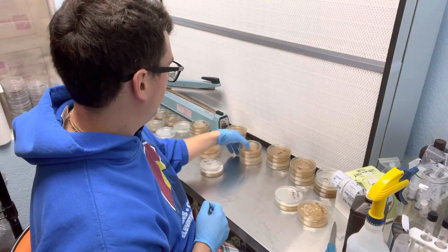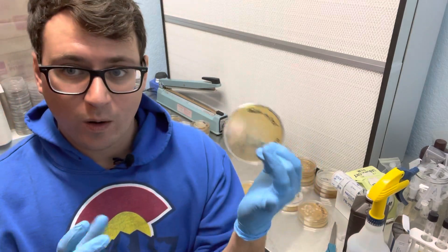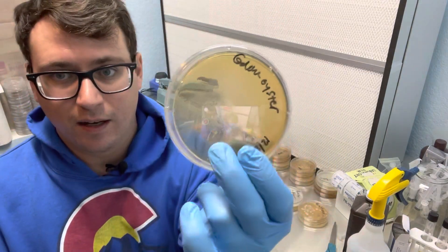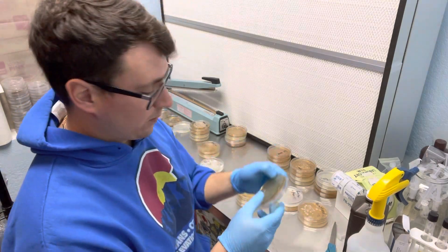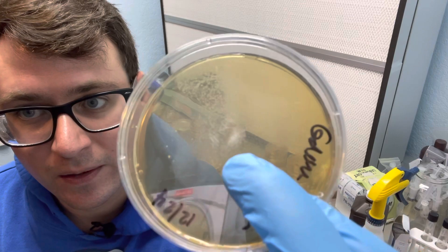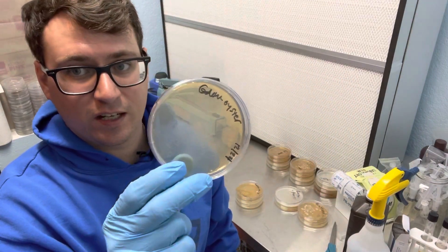But if we go to the golden oyster, this one is really taking off. You can see all those different colonies of mycelium starting. This was a 1 to 20 dilution of spores, or a 20 mil spore solution, and you can see how densely clustered all of these different spores that are germinating are — that is because there's probably millions and millions of spores. So this one is going to be a little bit tricky to isolate different phenotypes. See that white area right in the middle? That to me has already been spores that have done their connections — it's probably diploid mycelium at this point.